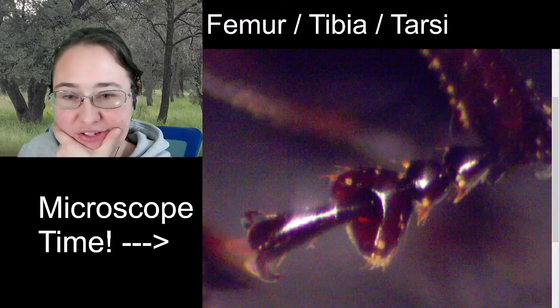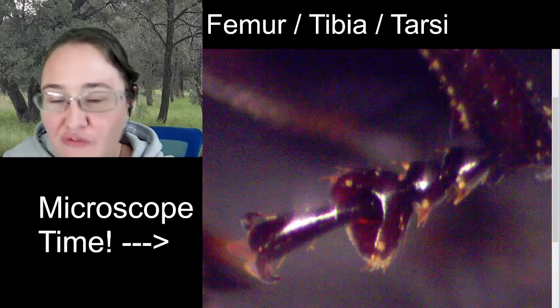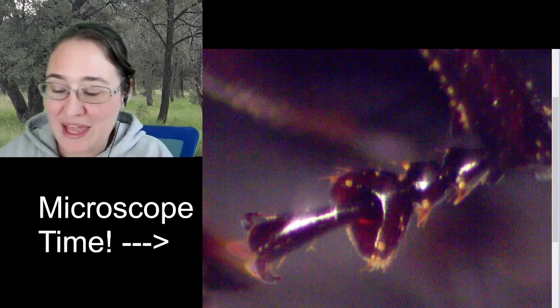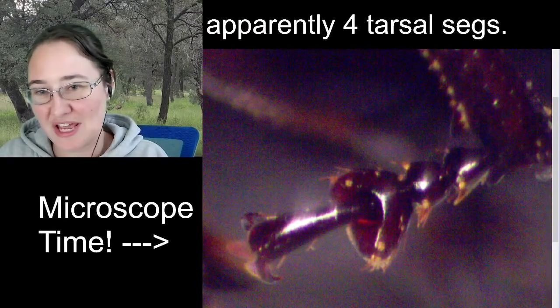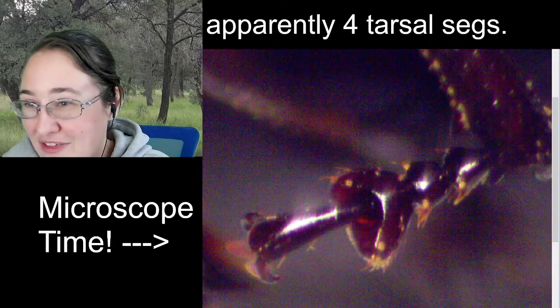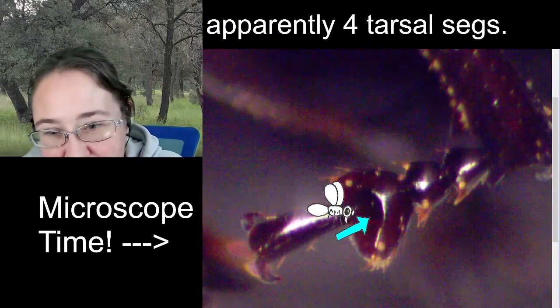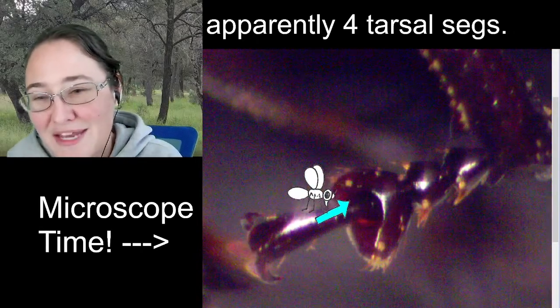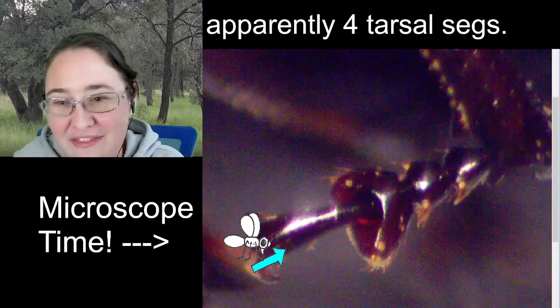All right, so those are our tarsal segments for the first leg. You might count four tarsal segments over and over again, because we are looking at apparently four tarsal segments. That's what we call this. There are actually five. I think a handful of you may have heard this before, but if you look inside of this cup-like segment, right there at the very itty-bitty base, there's a little bit of light coming from back there, and there is an itty-bitty teeny-tiny segment right there. So it's actually 1, 2, 3, itty-bitty four, and then 5 tarsal segments.